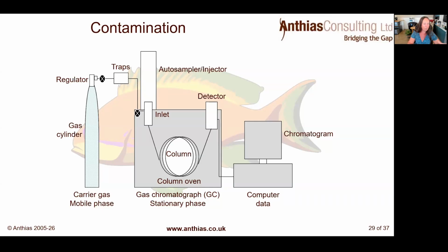So for example, ghost peaks are probably not going to be coming from our carrier gas. However, if you have exceeded the vapor volume of your liner, then the solvent will go outside of that liner and it can go back up the carrier gas line. We'll look at an inlet in a minute. But when it goes back up the carrier gas line, then it comes out in subsequent injections. You might be seeing that peak as a ghost peak for the next 2 weeks with really severe cases. So it could be that carrier gas line it's coming from.